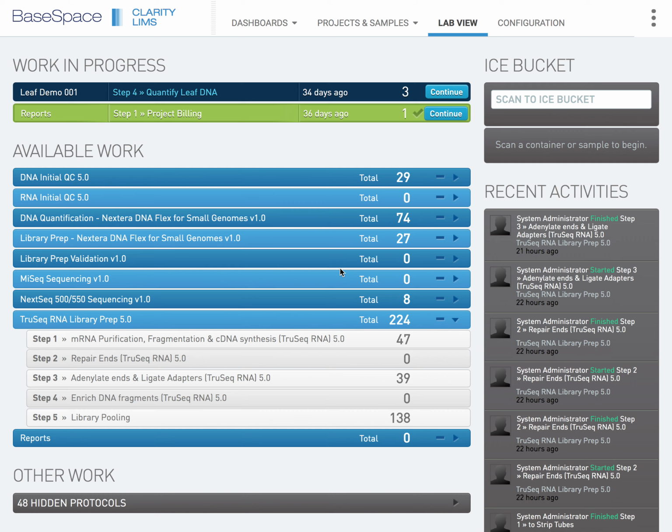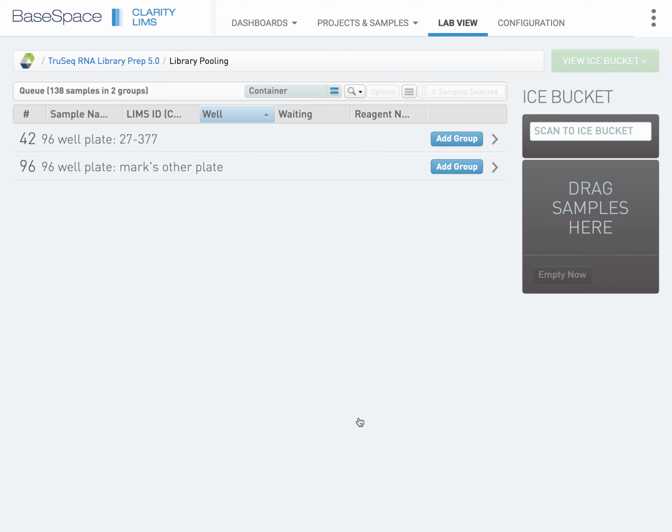In this video, we'll show how Clarity can pool samples, or rather allow you to track how the samples will be pooled. In the protocol that I'm running samples through today, in my fifth step, step 5, the step has been configured to be a pooling step.